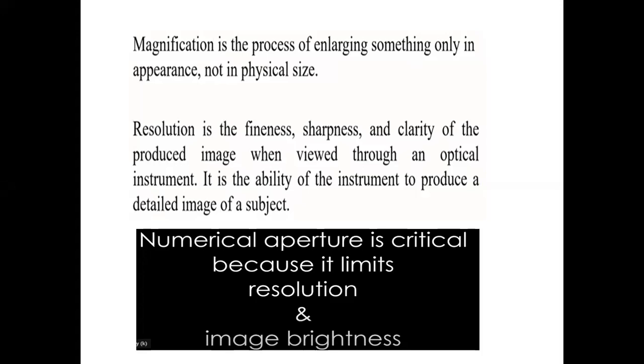As everyone knows, there are minute particles which cannot be seen with our naked eye, and they can be observed only through the microscope. And the importance of the microscope is its magnification. The organism is very small, which is not possible for you to see with your eye. But when you place it in the microscope, you can visualize the entire morphology of this organism. So this enlargement is known as magnification.